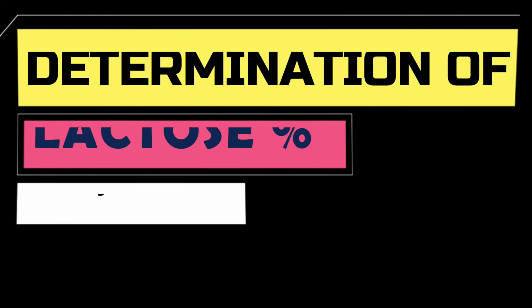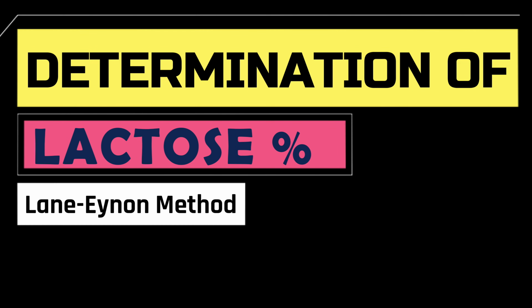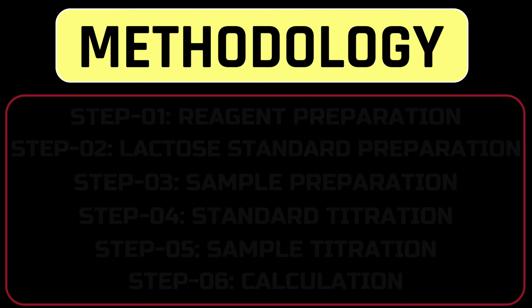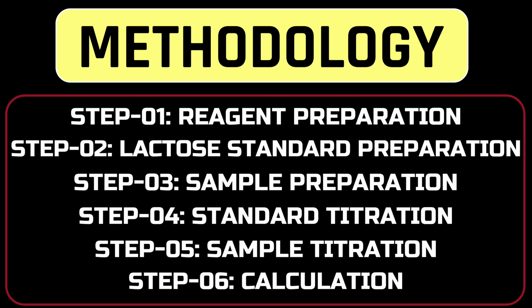Dear viewers, today we are going to determine total lactose percent by Lane-Eynon method. Welcome to Microchem's experiments. This experiment involves reagent preparation, lactose standard preparation, sample preparation, standard titration, sample titration and calculation.